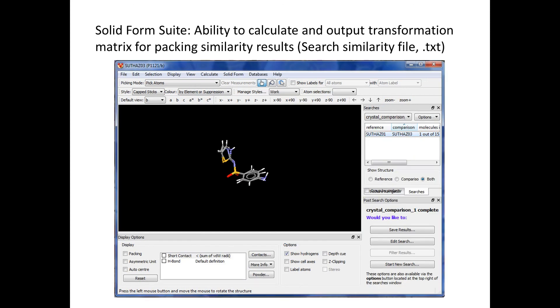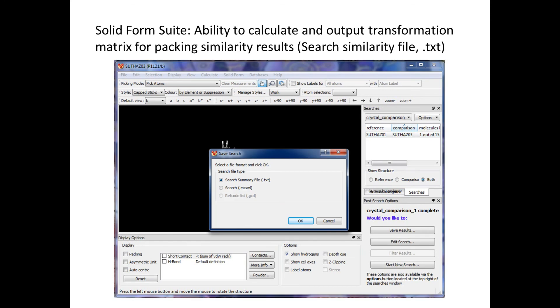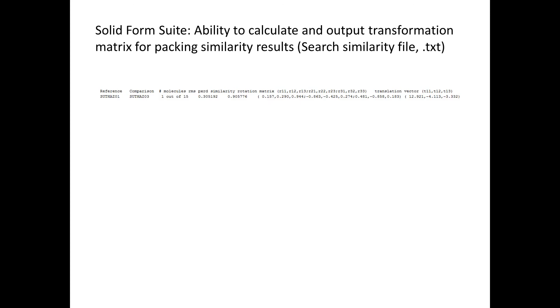What you get is the resulting two structures superimposed on each other to compare the packing. If you want to save those results, you click on save results and you have the option to save as a search summary file. This search summary file is the format you get for packing similarity results.